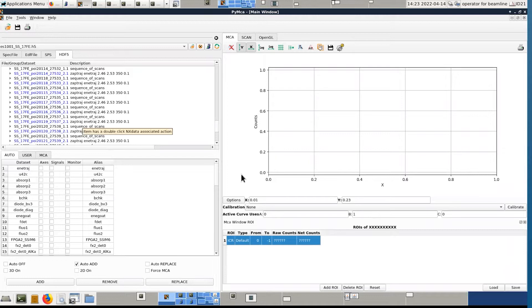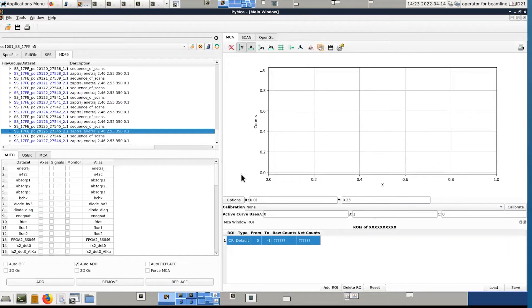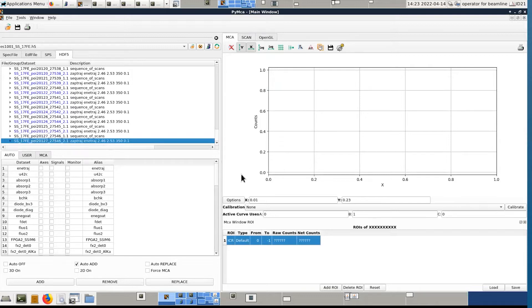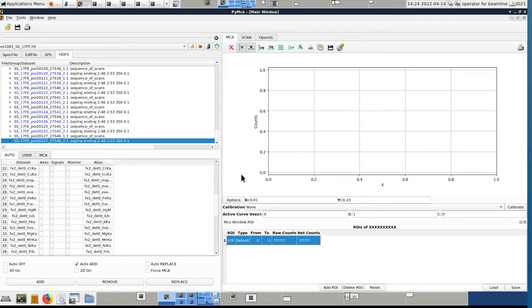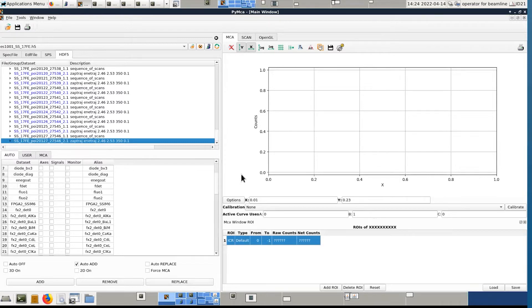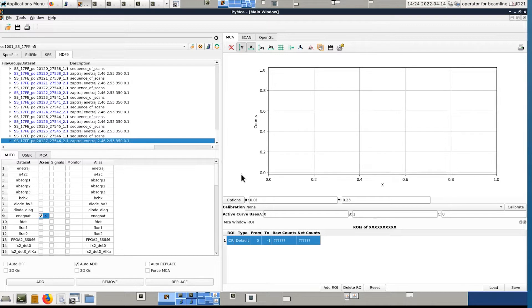So to see a scan, you have to click on the scan itself, not the sequence of scan, but the scan, and you have two options. Either you will use the auto panel where you have all the possible counters. So in our case, the x-axis, the energy axis, is named enegote. That's the counter from the monochromator, which is defining the energy.